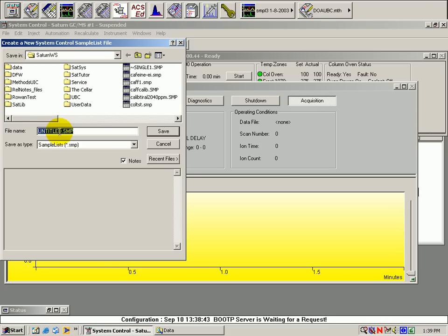Name the sample list and save it in the same folder where you will be storing the data.